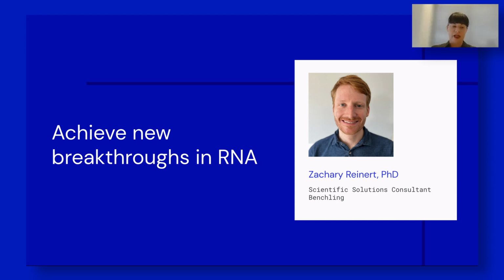Zach, who's here today as a scientific solutions consultant at Benchling, are you able to share some of your insights on this challenge based on your customer interactions? Thanks, Shauna. You're absolutely right. In my discussions with current customers, they've revealed that traditional software is inadequate to address both the chemical and biological intricacies of RNA therapeutics. They find that their systems are low throughput, very manual and laborious, and ultimately disconnected from one another. All this adds up to considerable delays in delivering results and lower quality data.